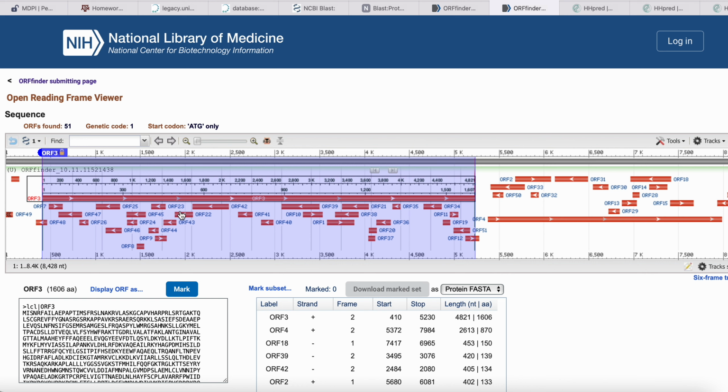These other things may or may not be translated, probably not in enough quantity to do anything, but occasionally you find something interesting in one of those. I would say, for now, don't worry about those. That's like a PhD research project, trying to dig into those.